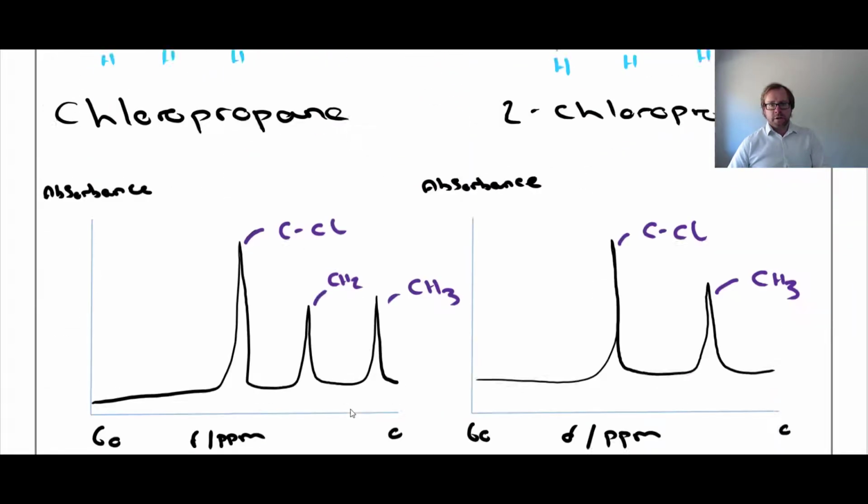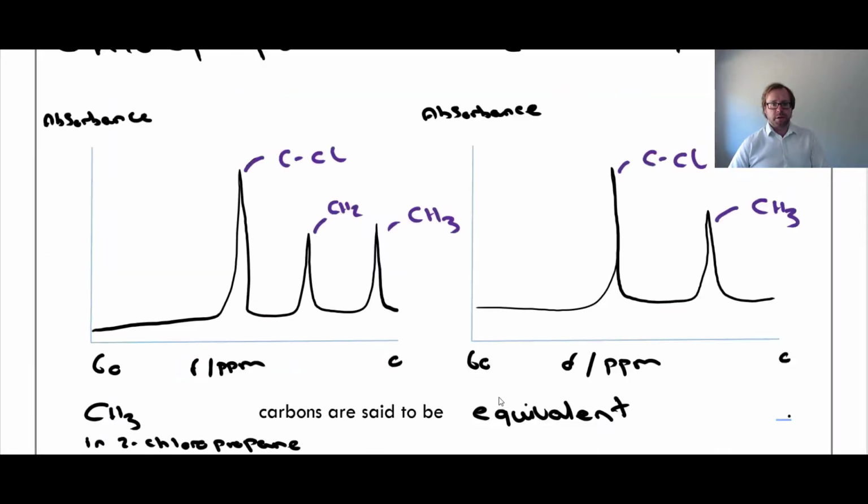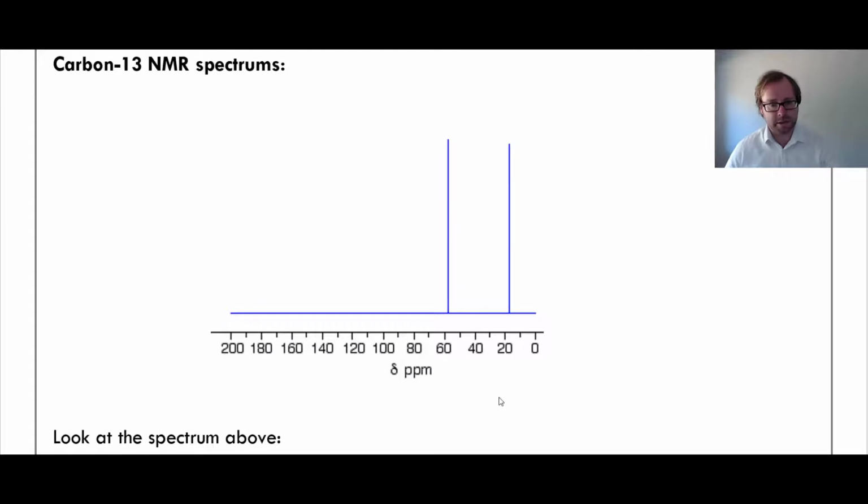Okay, so I'm sure you've figured this out. So if I go back up to my table, I can see that the CO peak has shifted further downfield, in values between 90 and 50 parts per million, which must mean that the peak that has shifted the furthest down must be my CO peak.